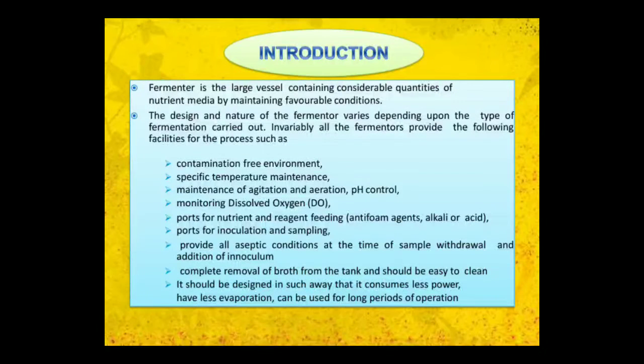We start with the introduction part. What is a fermenter? Fermenter is a large vessel containing considerable quantities of nutrient media, maintaining favorable conditions. It is mainly used for carrying out the process of fermentation. The design and nature of the fermenter varies depending upon the type of fermentation to be carried out.